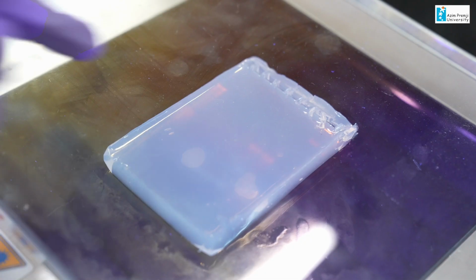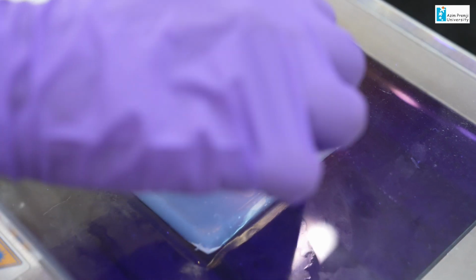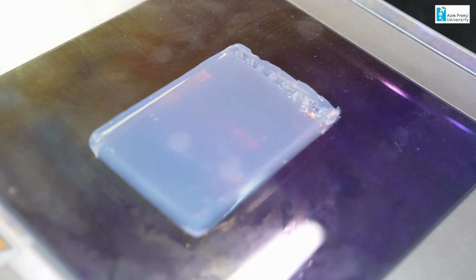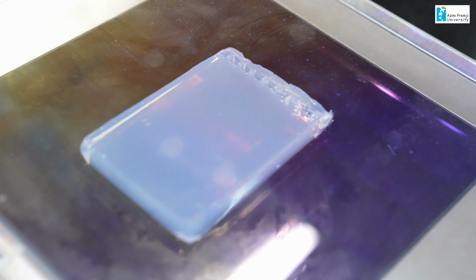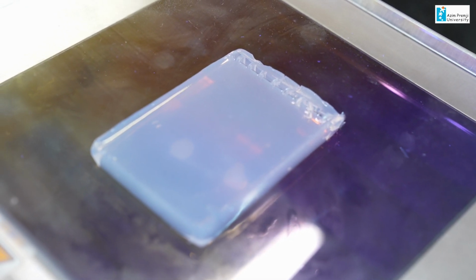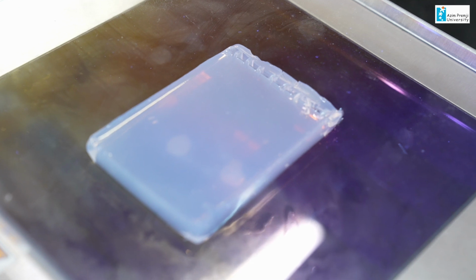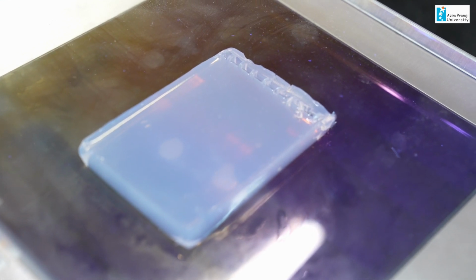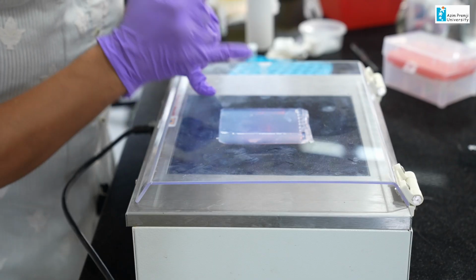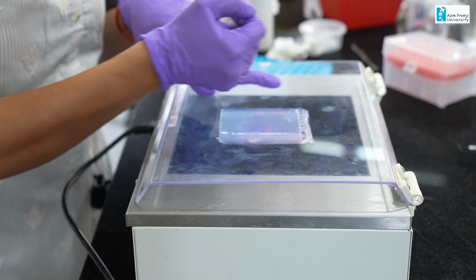You can see these pink color bands, these are the amplified products. While loading, I also loaded genomic DNA without amplification, without PCR. You can see the pink band very close to the well, that is the genomic DNA, and the 2 bands here are the amplified products, and this is the DNA ladder.